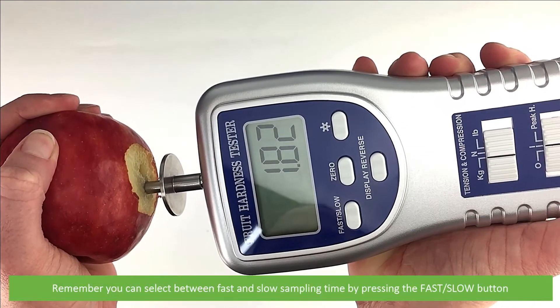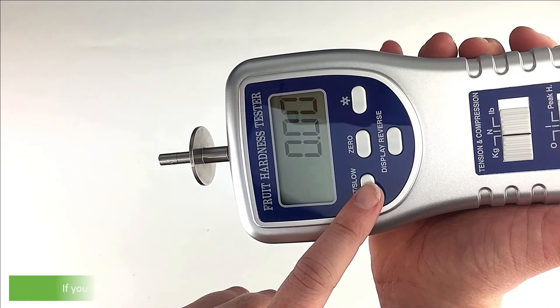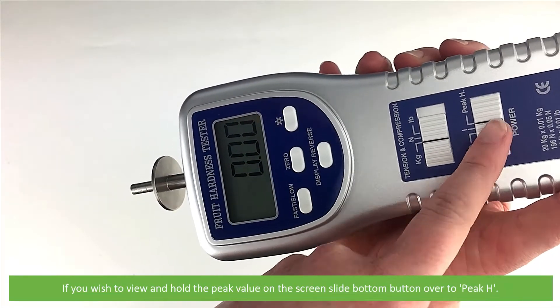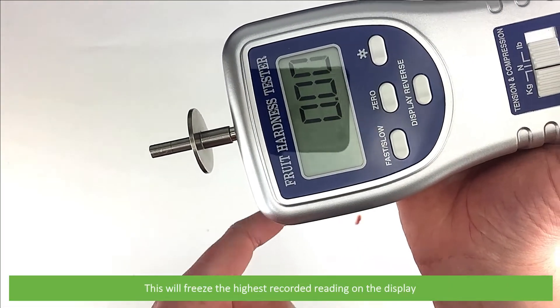Remember you can select between fast and slow sampling time by pressing the fast/slow button. If you wish to view and hold the peak value on the screen, slide the bottom button over to peak H. This will freeze the highest recorded reading on the display.